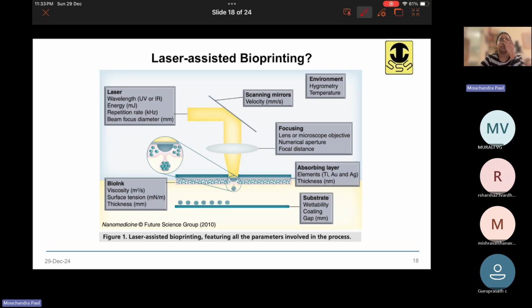See, you're missing the main point of why the droplet will form. Ma'am, are you asking about that ribbon or how that material will absorb? Yes, I'm talking about the role of the absorbing layer here, how the absorbing layer is acting in order to generate droplets.